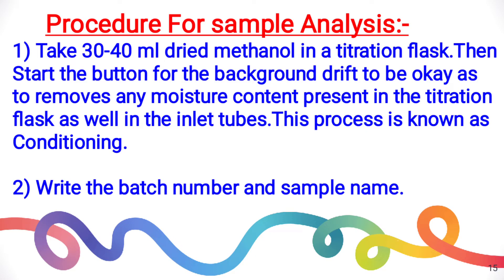If you want to analyze any sample, the operation of the Karl Fischer titrator software is shown here. The most important step before starting the titration is cleaning the titrating flask to avoid any side reactions. The titrating flask is washed with methanol 2 to 3 times. Then, take 30 to 40 ml of dried methanol in the titration flask and start the conditioning process, also known as background drift or conditioning. This process is very important as it removes the moisture content present inside the titration cell or in the tubings.